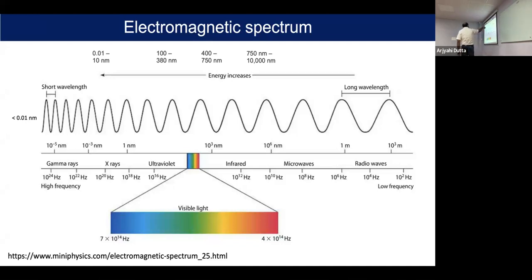So here, when you can see, as we go in this direction, our wavelength is getting shorter and shorter and shorter, and energy is increasing. Increased energy is really good, because that ray can penetrate through any sample. So whenever we talk about the electron microscope, the first thing that comes to mind is the transmission electron microscope. Whatever source we use should transmit through the sample. If we don't have enough energy, it cannot transmit. That is the reason we use the electron, which can transmit through our sample, and we can visualize it.